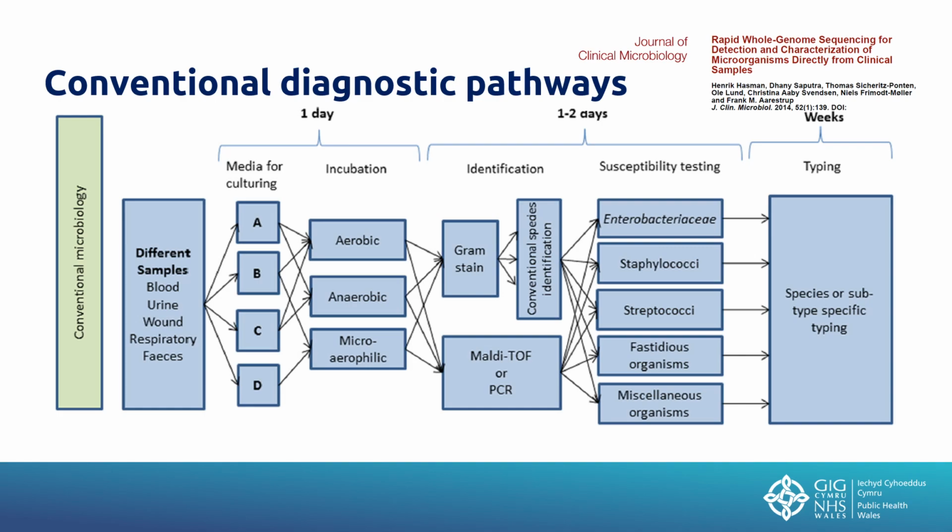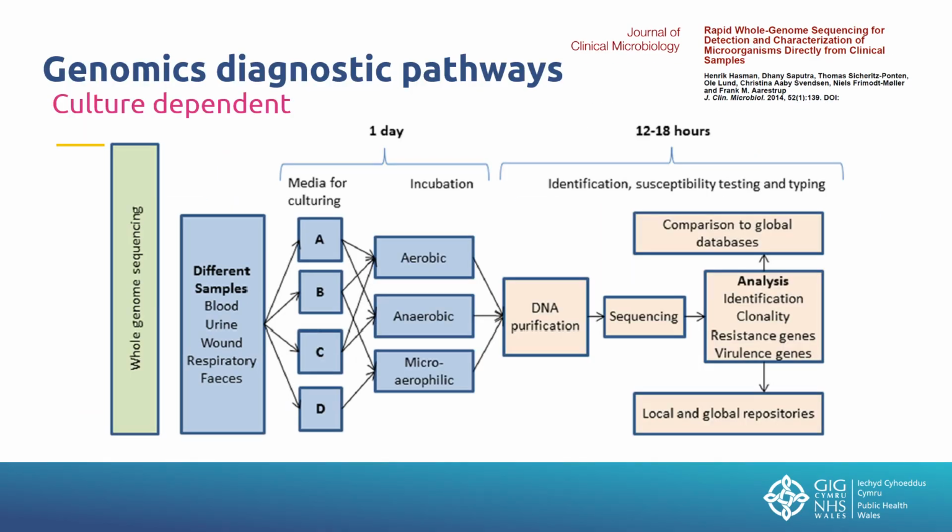So the first diagram within the publication shows a very complex workflow culminating in typing, which could take a number of weeks, whereas in a genomics diagnostic pathway, which is still dependent on culture, the turnaround time is significantly reduced, and the information that you're able to glean within that turnaround time of a number of days is superior to the traditional methods.